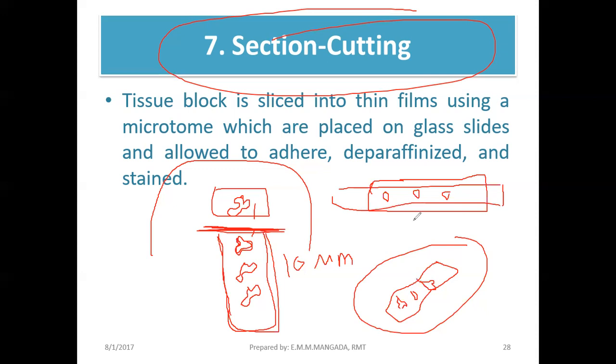The purpose of the oven is to melt these excess paraffin. Ito, yung mga excess dyan. Para ang maiiwan lang, guys, is itong portion na to, kung saan nandun yung tissue natin. Okay? And also, to prepare our tissue for staining. Okay? So, ito na yung final product natin. Okay, andyan na siya sa slide. So, for it to be stained, you have to melt the excess paraffin wax.